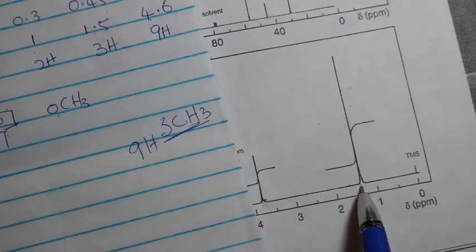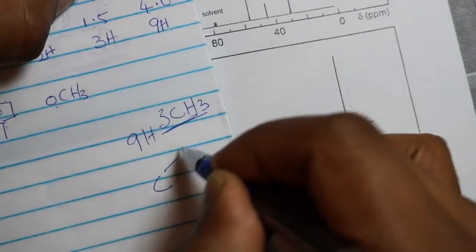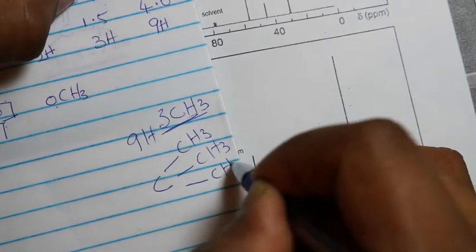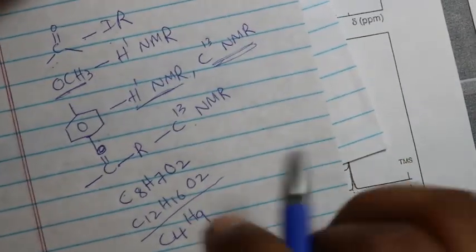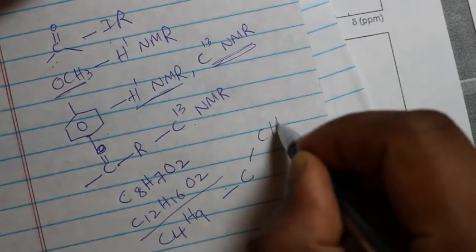This is also a singlet, which means those 3 CH3s are connected to a carbon with no hydrogens. So we confirm a group that looks like this, CH3, CH3 and CH3. So for C4H9, we confirm the group.